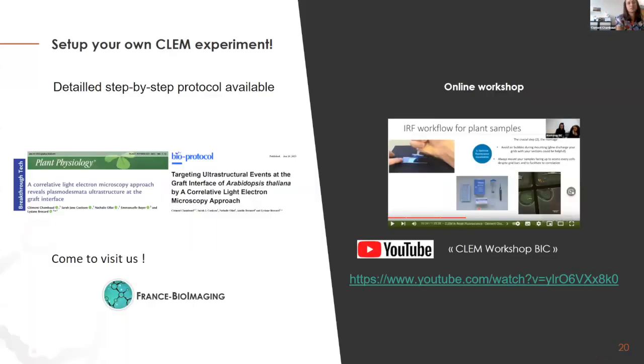If you want to know more about correlative microscopy and set up your own experiment, you can find our papers. There are two papers: Plant Physiology, which is the more biological paper but reoriented on the technology, and you have the step-by-step protocol on Bio-protocol.